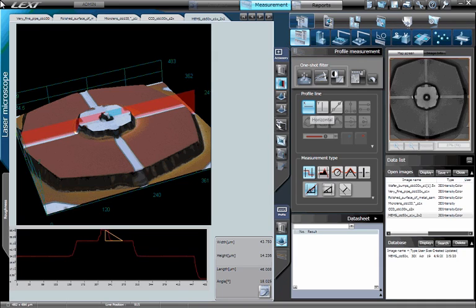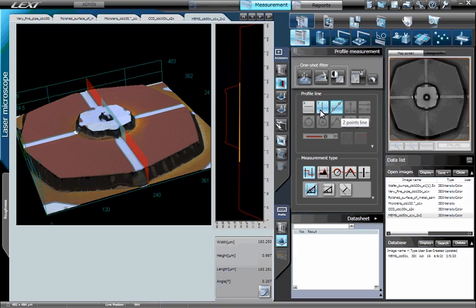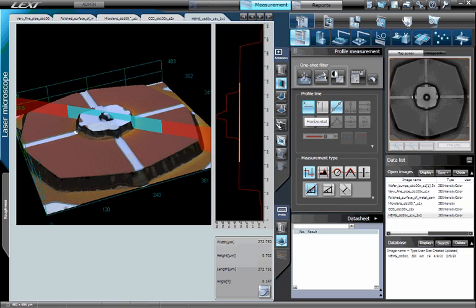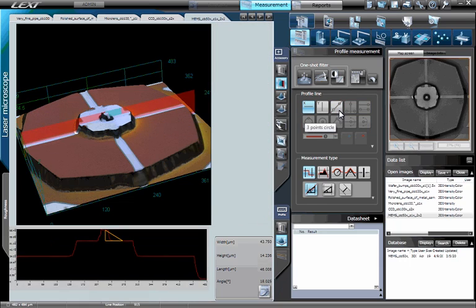The line profile can be superimposed across the X or Y axis by pressing the corresponding button. Further, you can position a user-definable line profile at any angle by pressing the next button. The remaining geometries in this window will become available when performing a line profile measurement in 2D mode. For this exercise, let's choose to superimpose a line profile across the X axis.